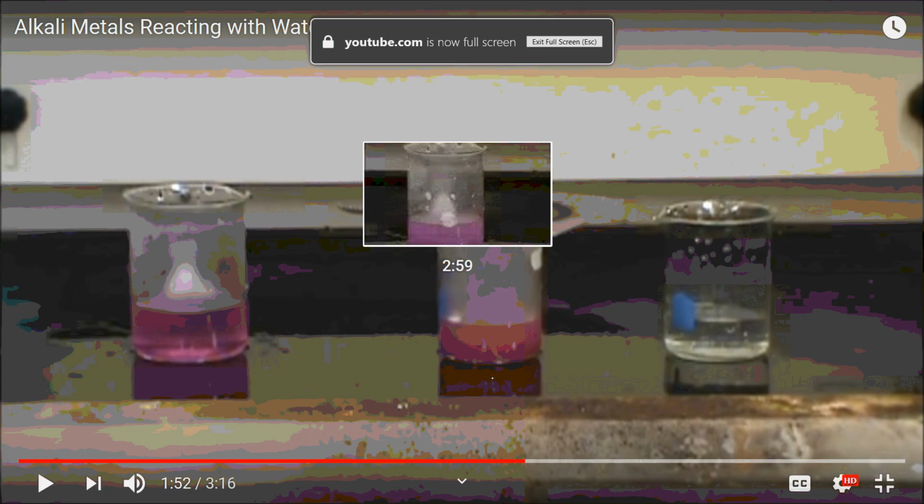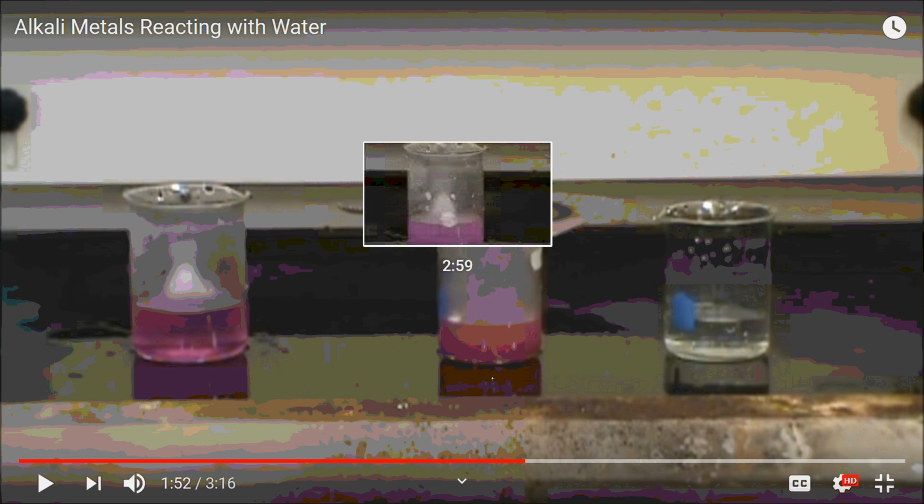Everyone, welcome to this video on reactivity. This is a continuation of the series on periodic trends. What I have here is a very short video showing the reaction of three metals.